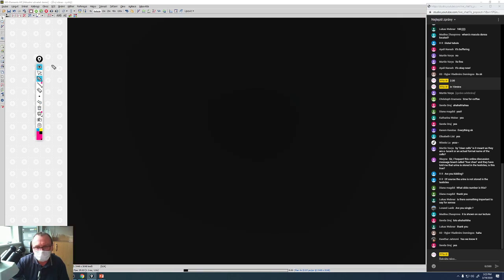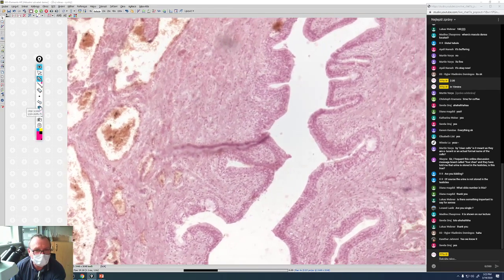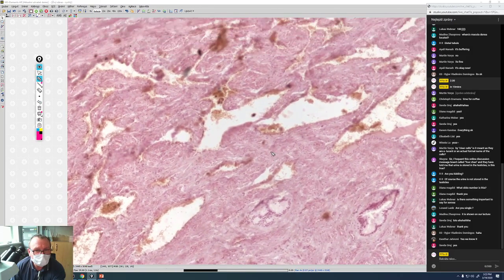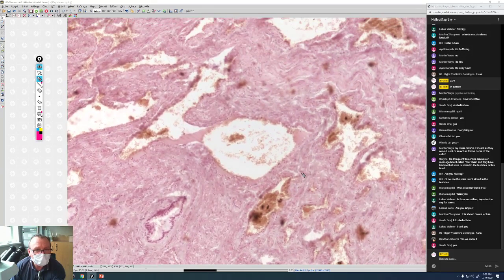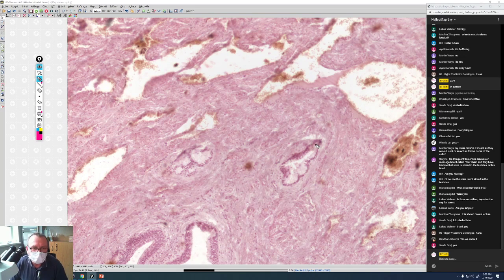Now we'll go back to small magnification, and we'll look for other mucous glands, which are not intraepithelial, but are situated in the mucosa and can penetrate between cavernous spaces into the muscularis, and they are called paraurethral glands of Littre. They are also mucous. They are secreting the same type of mucus as the intraepithelial lacunae glands.